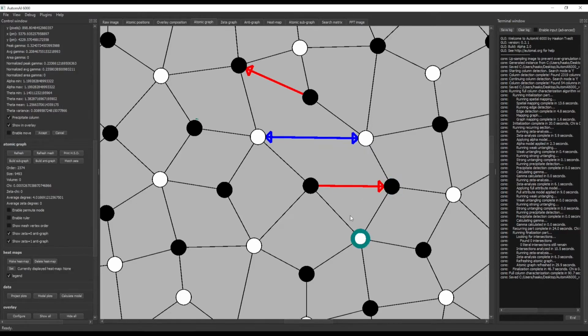We start at one edge and we see here is 4, so that is all good. This should really be a 4-sided one. So I'm just going to put this back, and you see now I have 4 sides, which is good. So I know that this edge should be the correct one, and I have an available connection here because this is again a 3-sided mesh, so I can move that there.